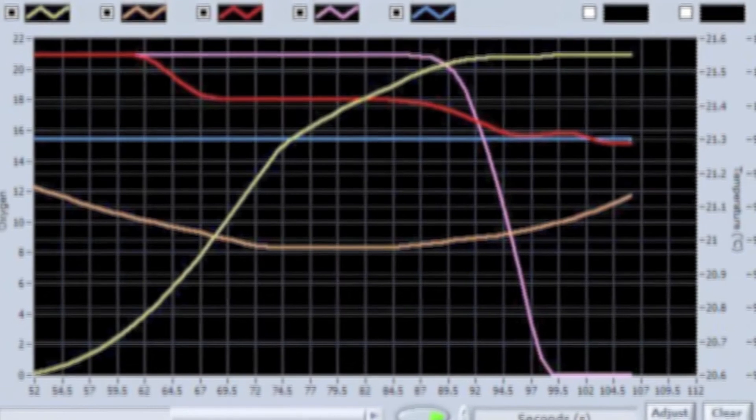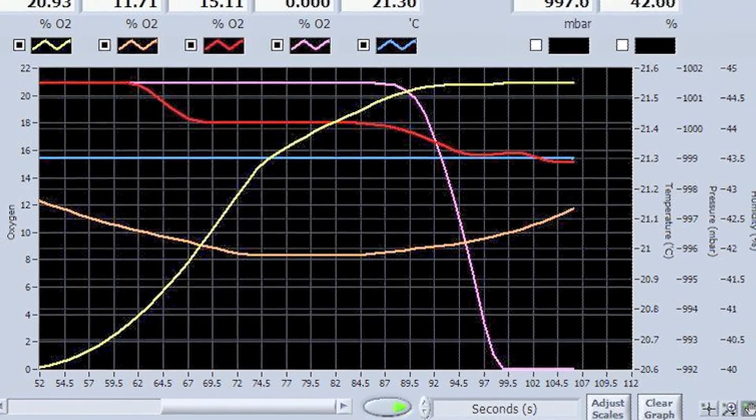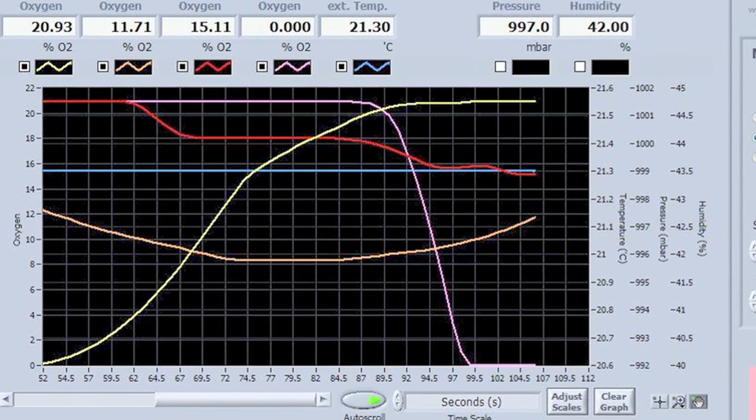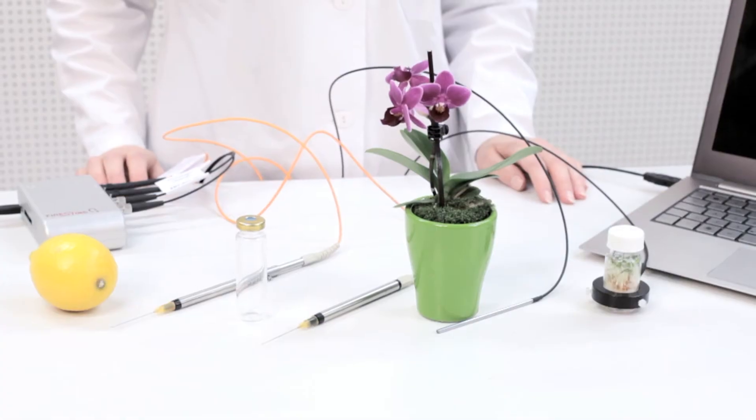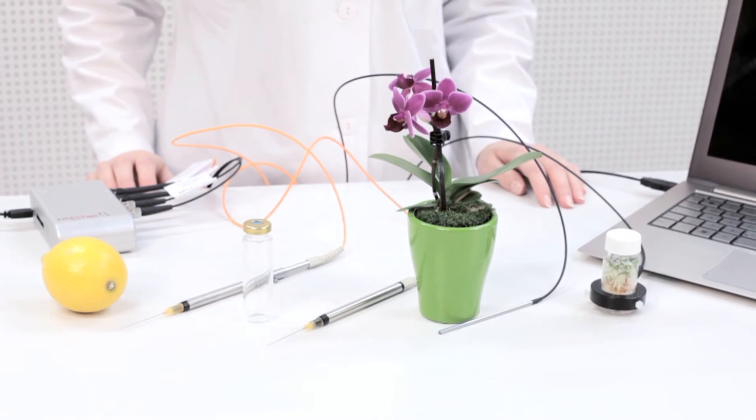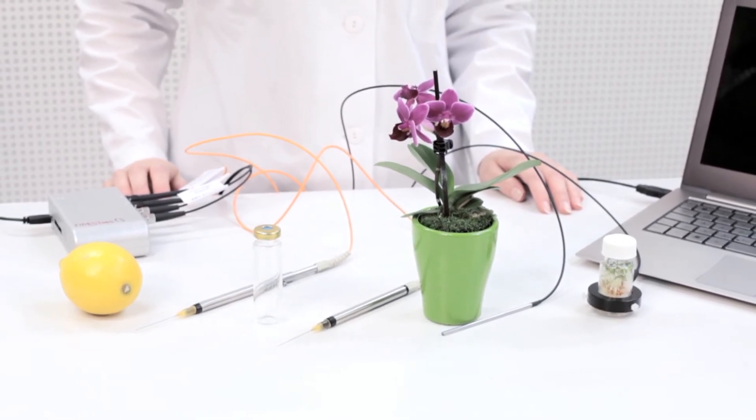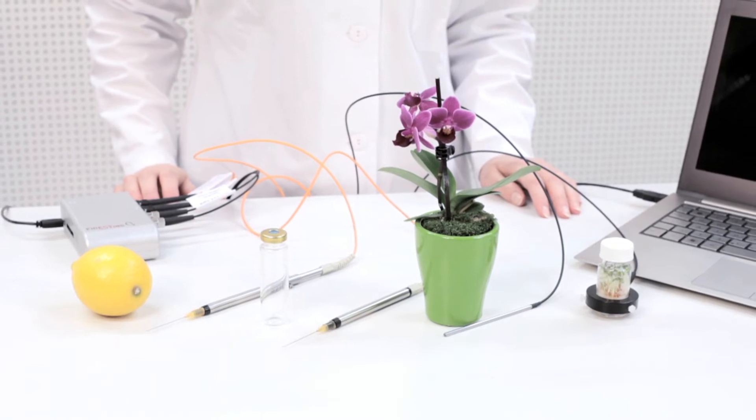The Fire Sting O2 meter comes with a user-friendly logger software, allowing simultaneous control of up to four different oxygen sensors. After you have decided which sensor type is best suited for your specific application, it is only a few steps to start measuring with our plug-and-play system.